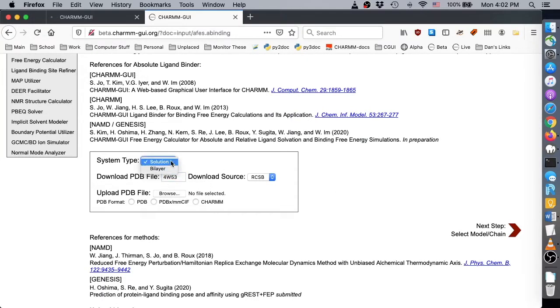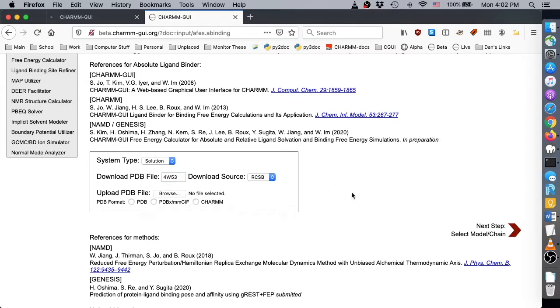In another video, we show how to make membrane protein systems for binding free energy calculations, but for this demo, leave the system type as solution. Enter the RCSB ID 4W53 and click next.